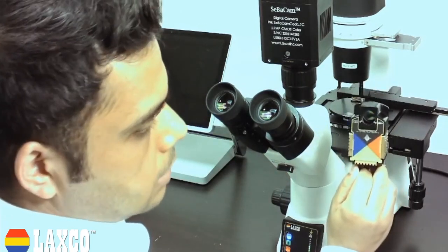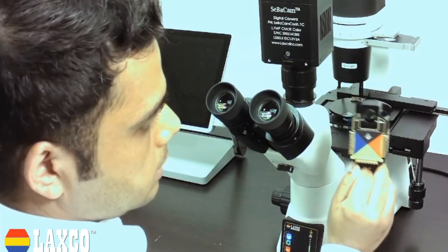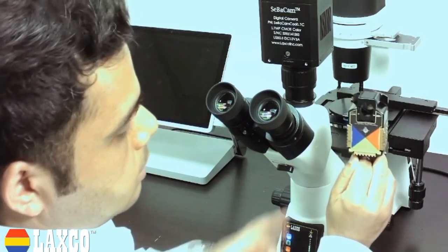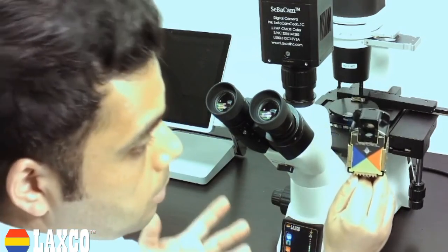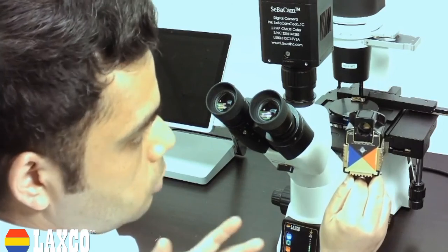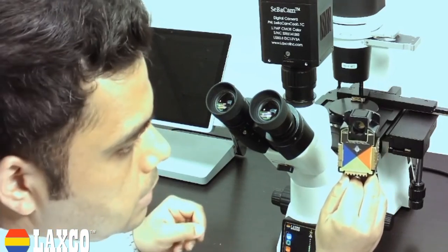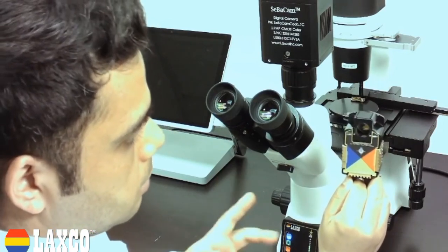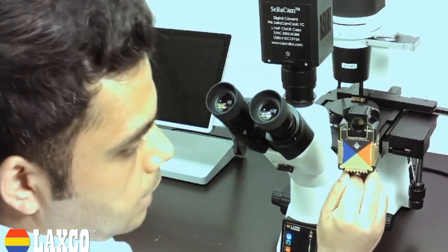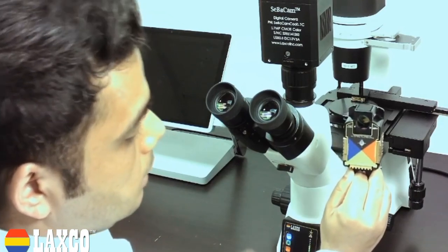This is our patent pending fluorescent module. As you can see, there are no moving parts on it. You don't need to move any levers to change channels and take independent images. It's all available at the click of a button.